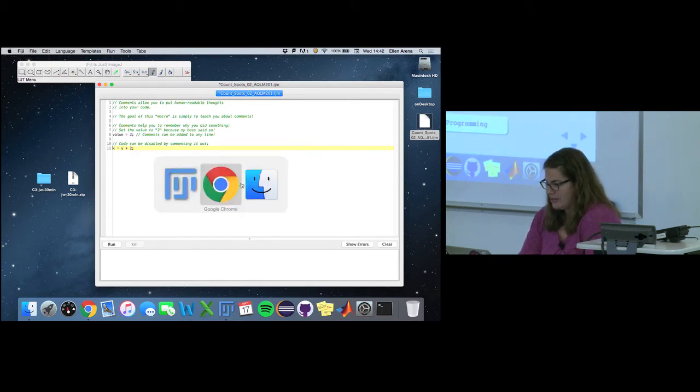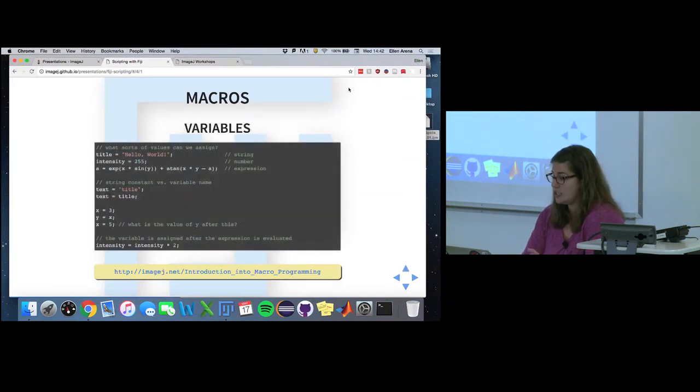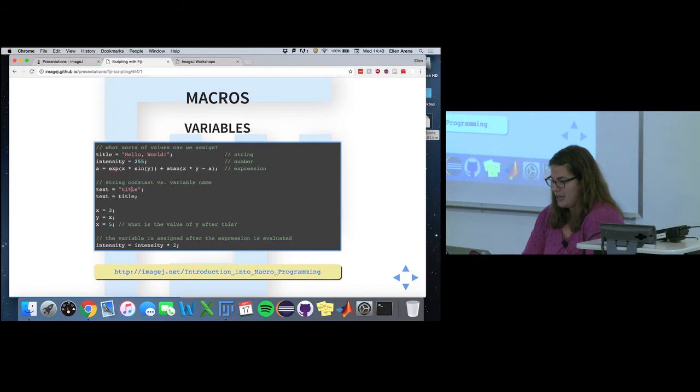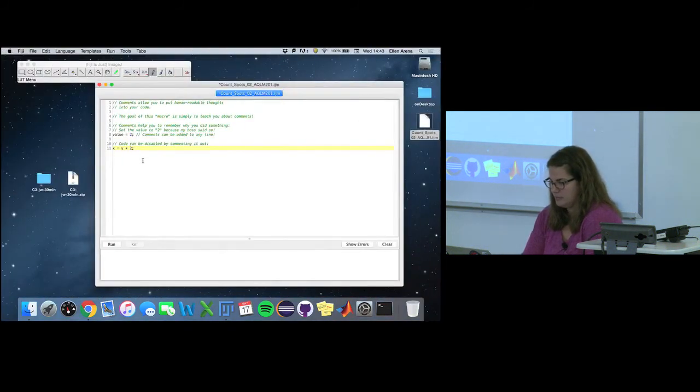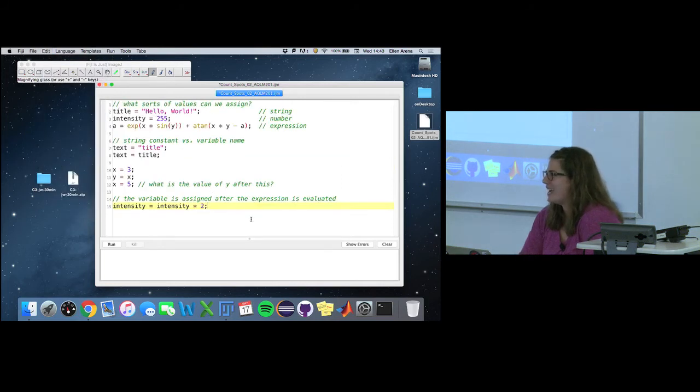So the next slide should be variables. And again, if you get lost, just hit escape. Because now we're in a 2D part, so just go down to the variables, select all of that and highlight it. Copy and paste it, just over this other stuff, it's fine. Oh, I could make this bigger again. You guys need to remind me. I'm really bad at remembering to increase the font size when I copy and paste, so just remind me.